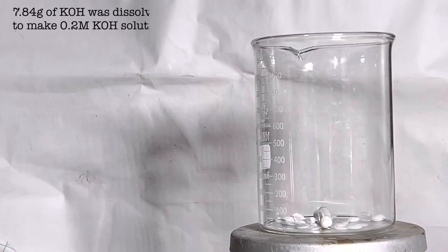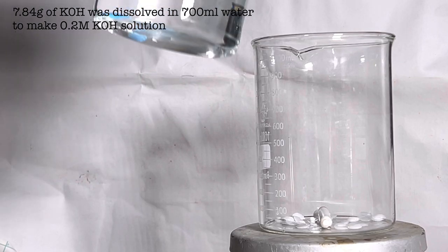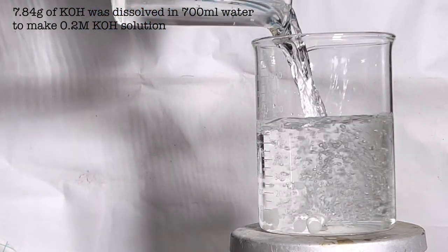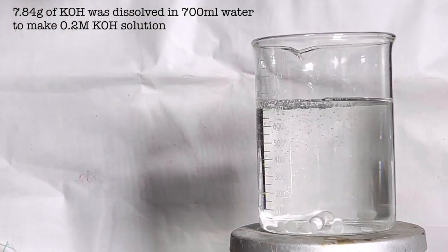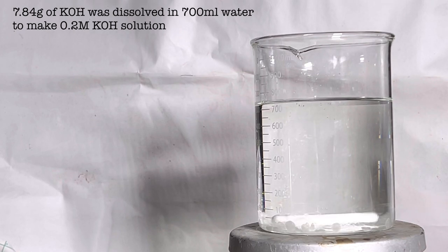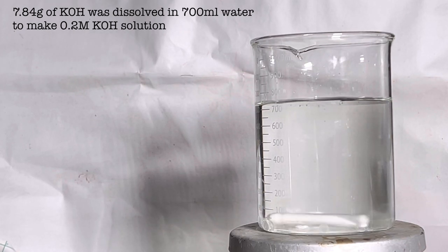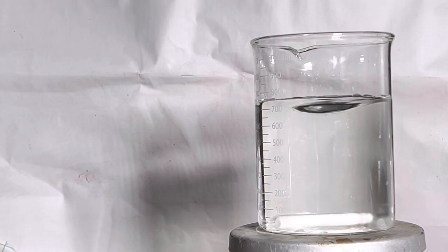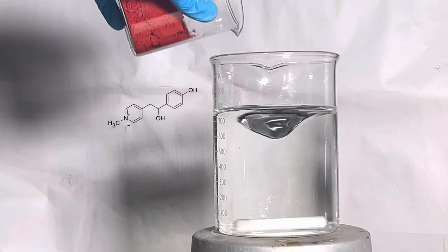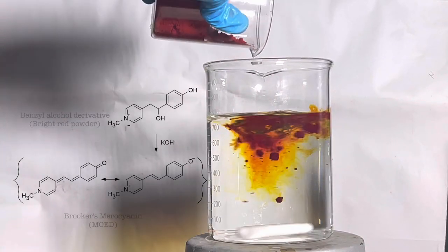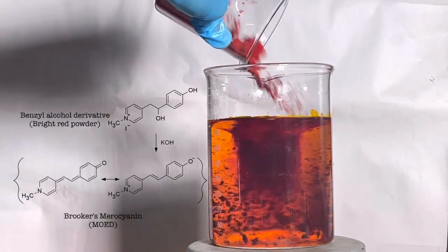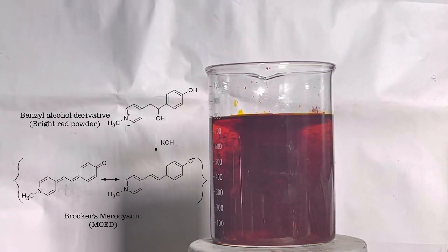Next we take a 1000 milliliter beaker. We will be making a 700 milliliter 0.2 molar potassium hydroxide solution. I have taken 7.84 grams of potassium hydroxide pellet and I added 700 milliliters of water which would give a 0.2 molar solution. Now add the previously made bright red powder to the potassium hydroxide solution. The compound very easily dissolves in it giving a deep red to almost black colored solution.